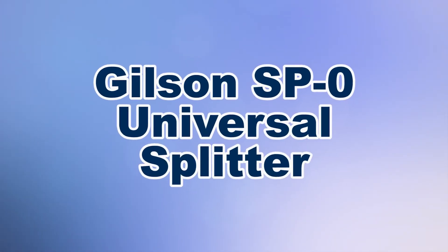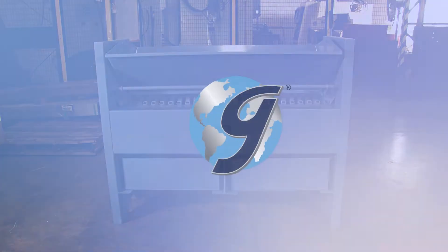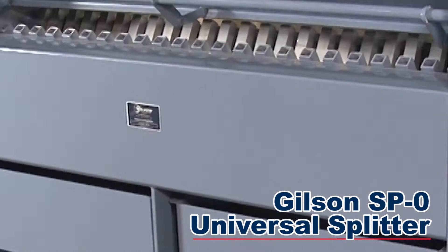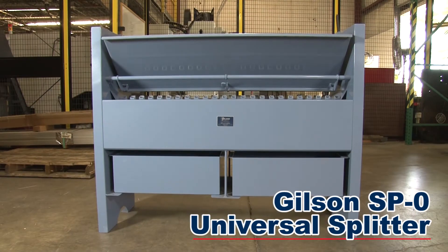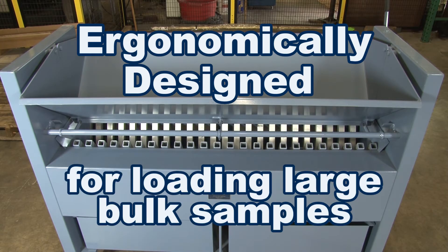When you need accurate representative sampling for your materials testing, Gilson is your best choice. The popular and versatile Gilson SP0 universal splitter is built for large volume bulk aggregates, ores, or raw coal samples. At 41 inches tall, this rugged and large capacity splitter is ergonomically designed for loading large bulk samples.